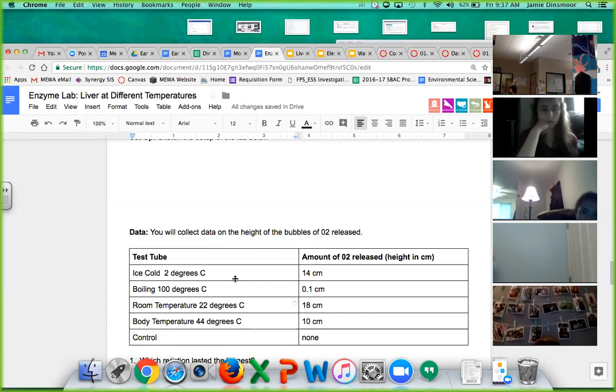Well, dang, I might not be able to do the proving of the oxygen because I need a lighter. I'm trying to think about where one is. All right, so we might not be able to prove this right now. I might just have to explain how we would do it. And I might find a lighter in a few minutes and be able to prove it.